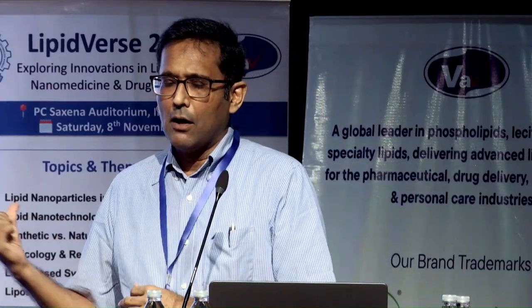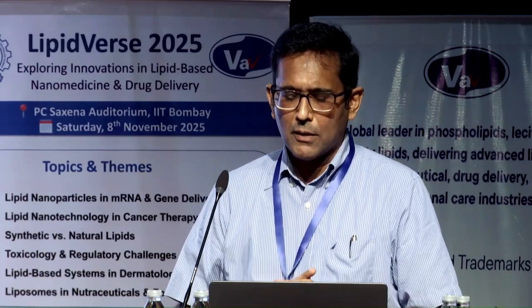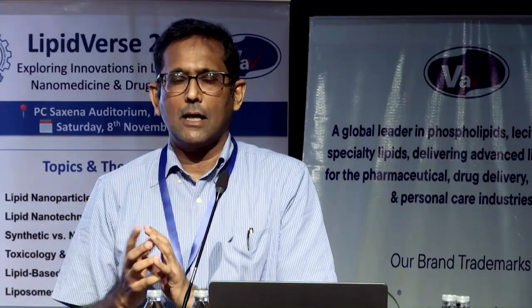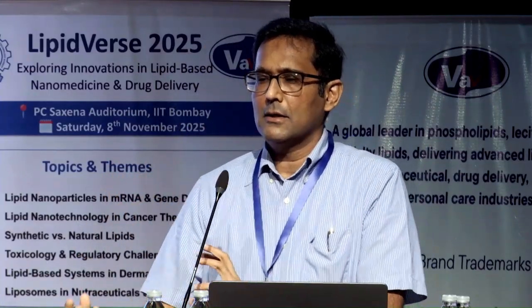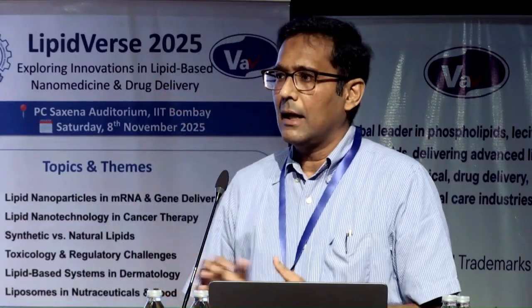And as I pointed out later, maybe it can be a kind of point of care therapeutics for liposomal drug delivery, where you can just have a cartridge with the lipids coated in this kind of packed bed, and an aqueous solution. You just push it at the point of delivery, and you get the solution straight away injected, and so on and so forth. And so with that, I'd like to conclude this talk, and will be happy to answer any questions.